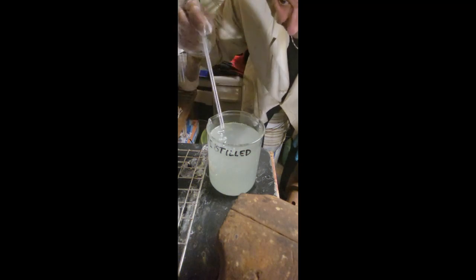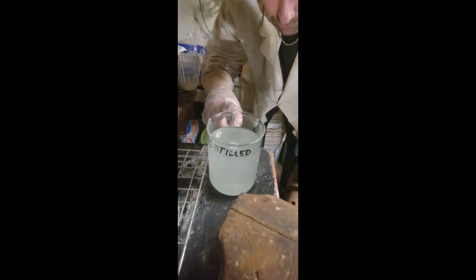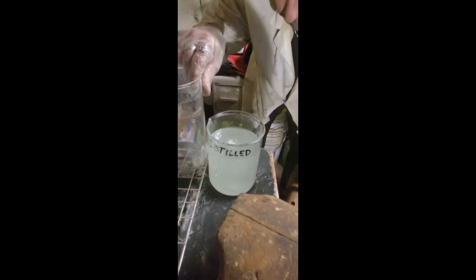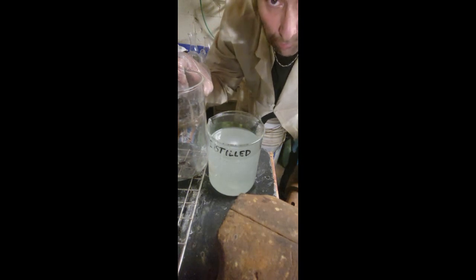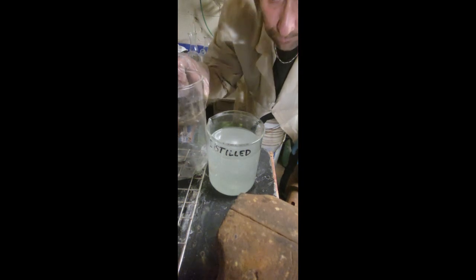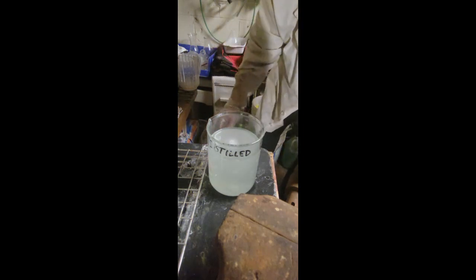Add in your source of nitrate. Again, 1 liter beaker, 800 milliliters of water, 100 milliliters measured out of potassium nitrate or nitrate of your choice. If you're going to go bigger, say 2 liters, just double it up. Whatever liter your beaker is, use that equivalent amount in milliliters of your nitrate. Mix it in and that's it. It's simple. Let's get to the other part of the lab.